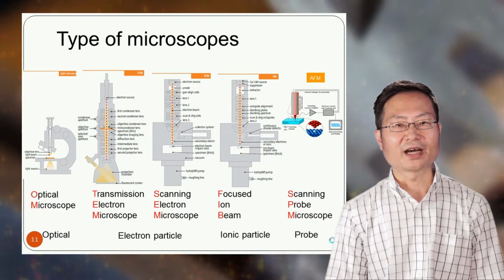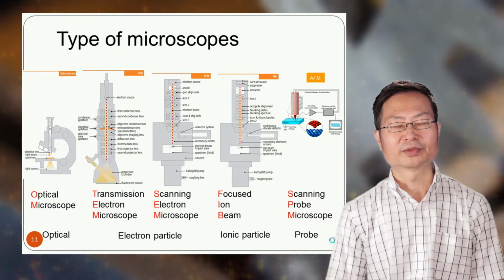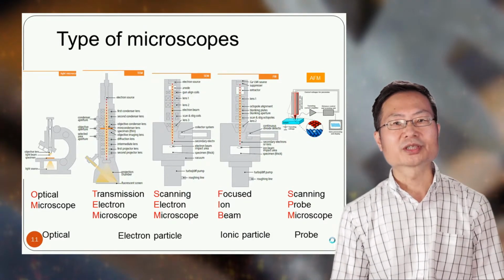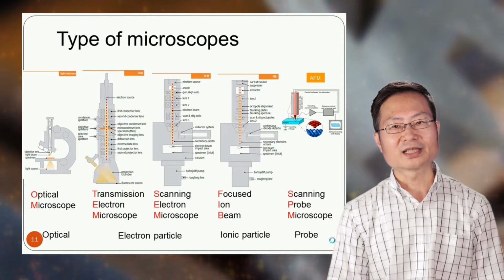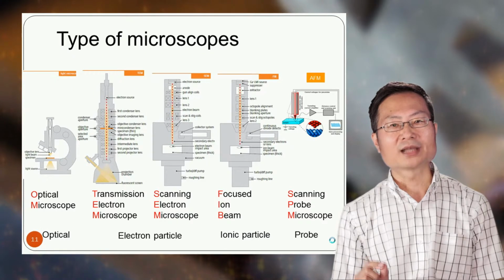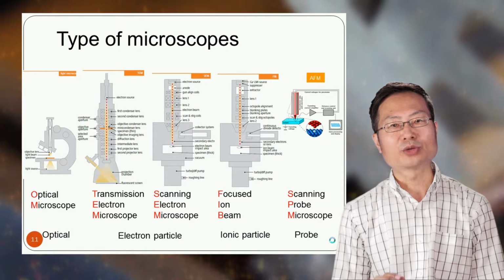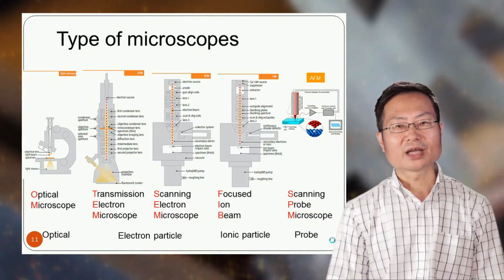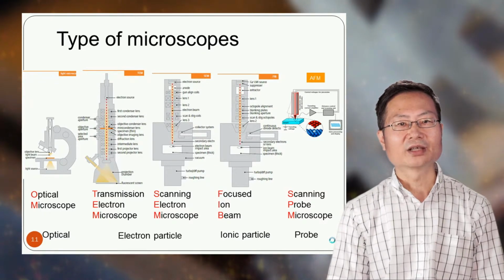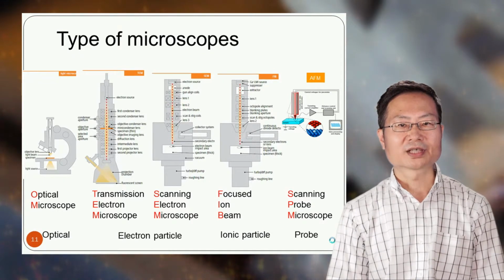Microscopy can be classified into three types: optical, charged particle, and scanning probe. Optical microscopes are the most familiar to everyone. They use visible light and transparent lenses to see the object. Their magnification is about 1,000 and enables the eyes to resolve objects separated by 200 nanometers. Electron and ion microscopy use electron or ion particles instead of light and use electromagnetic lenses to focus the particles.